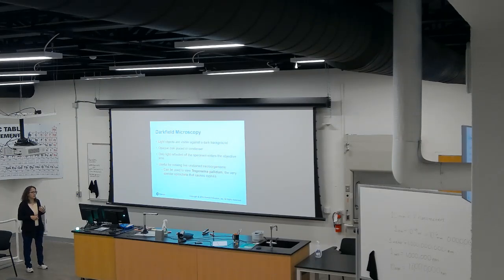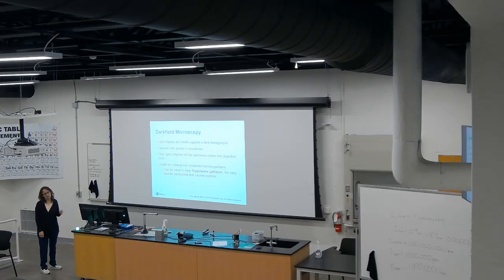A typical example of a microorganism that can be observed through this microscope is Treponema pallidum, the spiral bacteria that basically causes syphilis. This bacteria is so slender and so fragile that if you try to stain it, it will be destroyed. So then you use dark field microscopy.